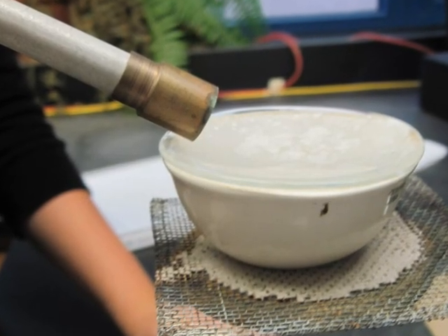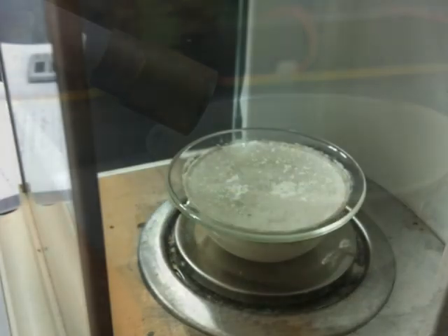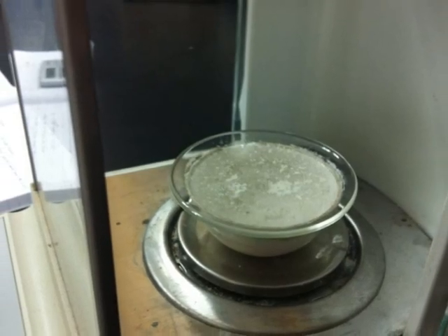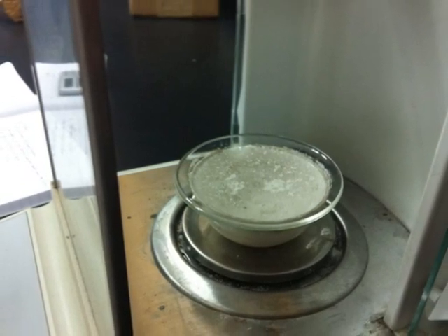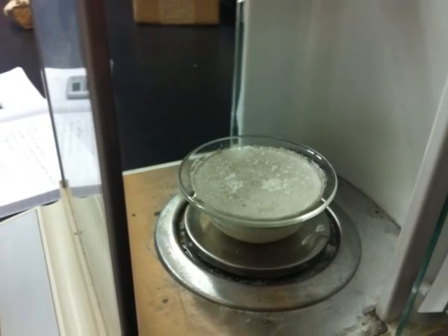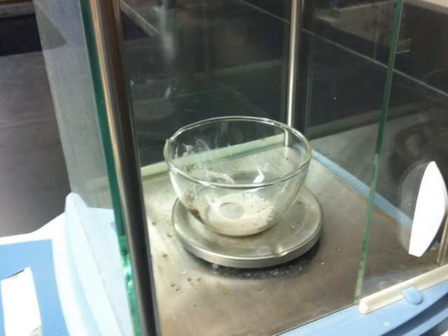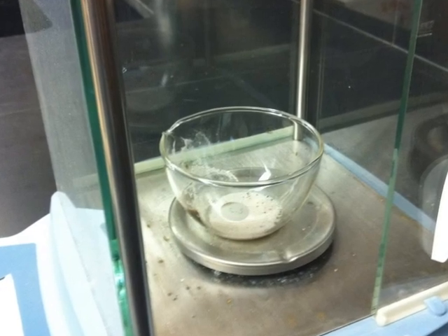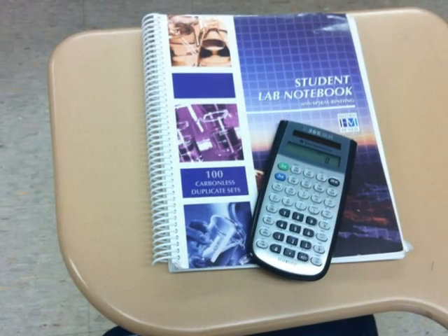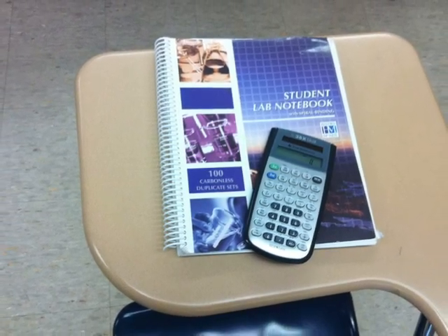Carefully heat any moisture that formed on the watch glass. When completely cool, weigh the evaporating dish containing the salt. Do not remove the watch glass or salt may flake off. Dry the sand in the oven or with a gentle flame. When dry and cool, weigh the Pyrex dish. You will now calculate the mass of each component in your original sample along with your percent recovery.